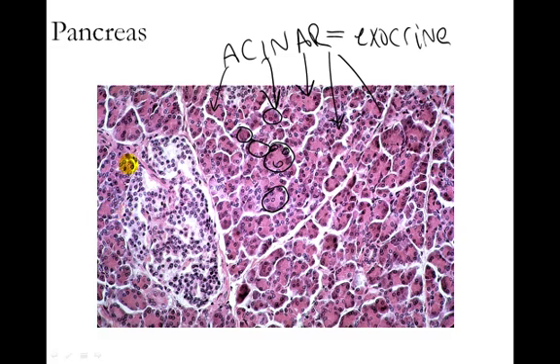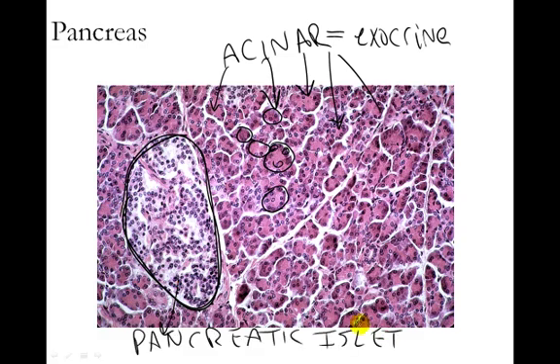You're also going to notice that there is an area of this slide where the cells look different. This particular area, which is a compartmentalized bundle of different cells in the pancreas, is called a pancreatic islet. It's also known as an islet of Langerhans — Langerhans being the person it was named after. This pancreatic islet contains four different types of cells: alpha cells, beta cells, delta cells, and F cells.